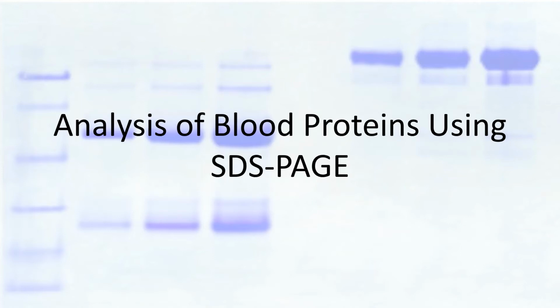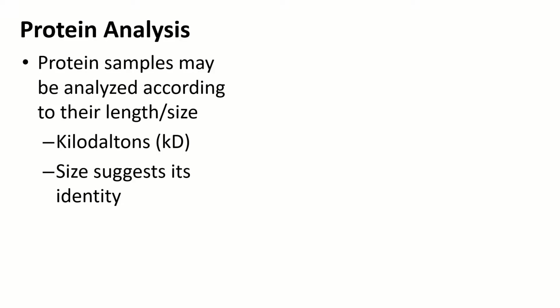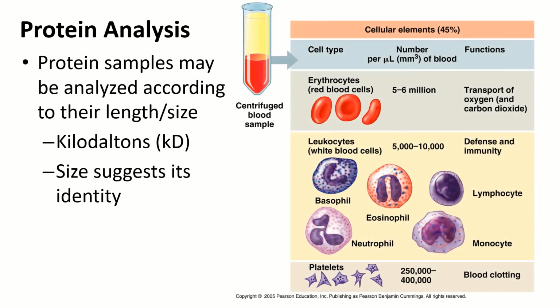In this video, I will be discussing the key concepts that are to be observed in our exercise on SDS page. So, SDS page is actually an acronym which stands for sodium dodecyl sulfate polyacrylamide gel electrophoresis.